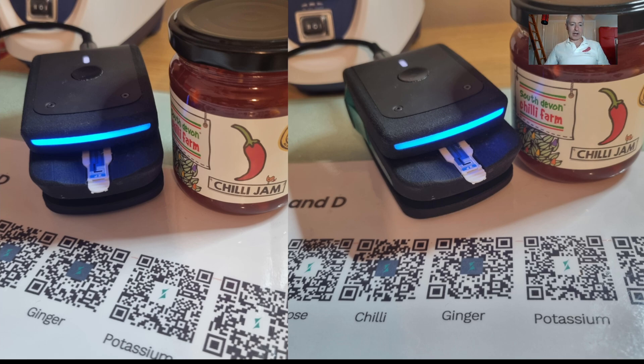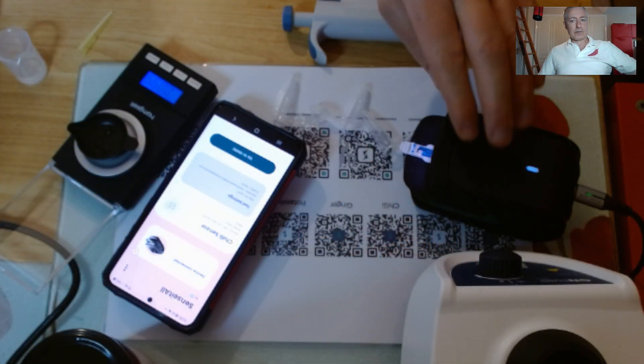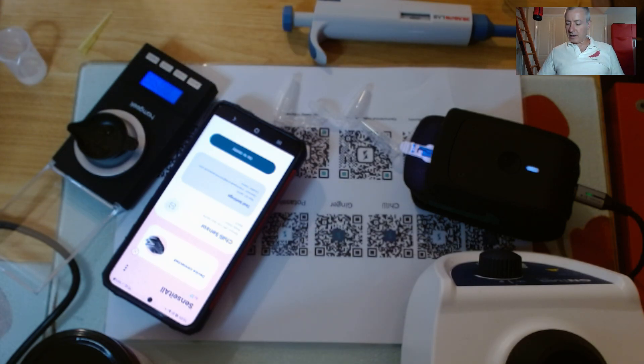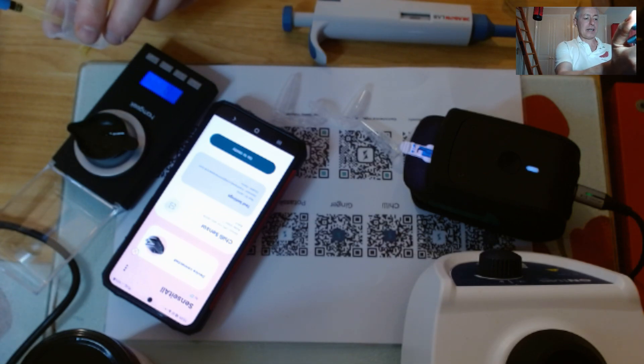With that said, I'm going to go ahead now and make a preparation of the sample and do a test on it to measure the Scoville heat units. So if I just go to this particular camera – I've got the Scoville meter here, I've got a chili sensor in here. I've actually weighed out almost 0.1 grams of the jelly into this weighing boat, and I want to add in 0.9 milliliters of the chili pot buffer. I'm doing what's really called a 1-in-10 dilution.